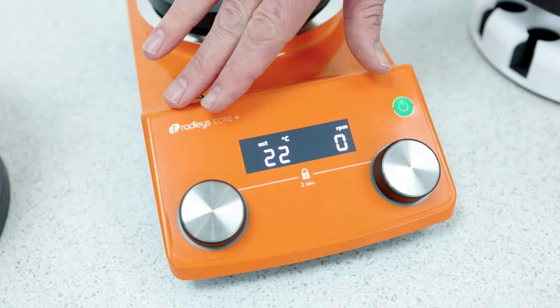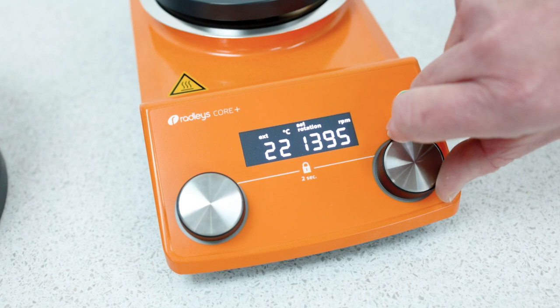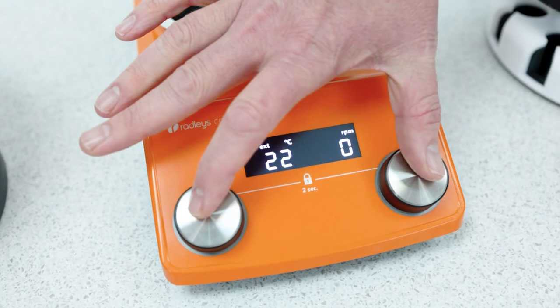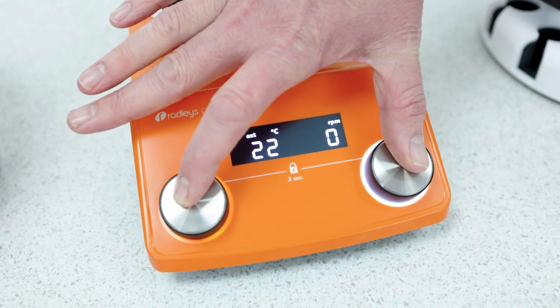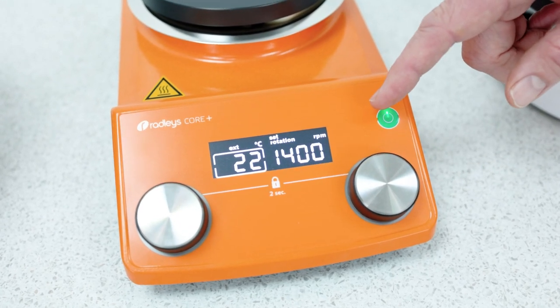The Carousel Core Plus hot plate has a digital interface with the ability to stir up to 1400 RPM. It also has a safety locking feature so that if you accidentally brush past, you won't change any of the set points you've placed in.